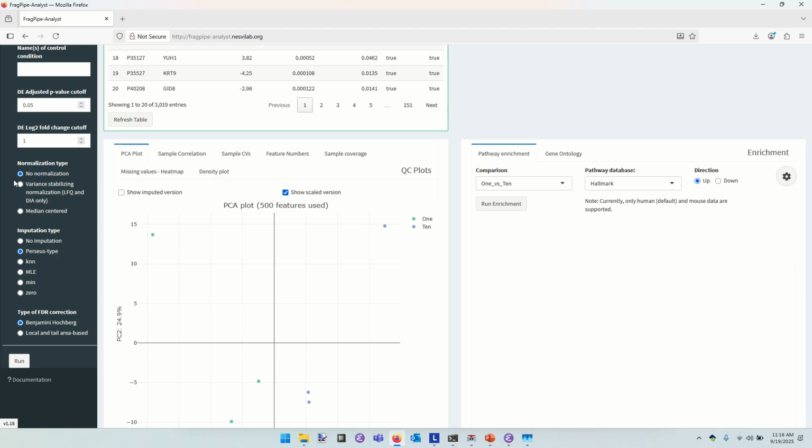It's an area of the data analysis where having a proper biostatistician, rather than somebody who kind of talks about biostatistics, would be helpful. And frequently, with a lot of the projects we were doing at my prior university, we spent a lot of time trying to find anybody we could talk to to address the biostatistical issues. The bioinformatics were not necessarily the limitation, but the interpretation of the values from bioinformatics was very much the issue. This is one of the reasons why I ended up teaching myself how to do statistical models for multi-factor tests, because we just couldn't find statisticians who were equipped to help us in proteomics.